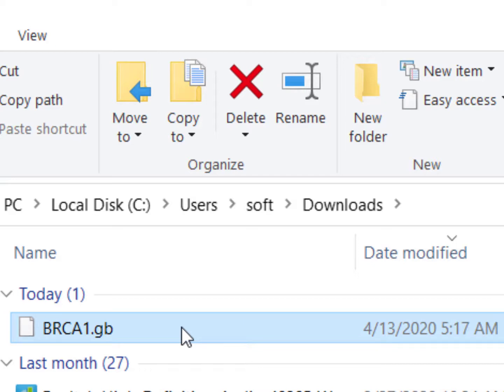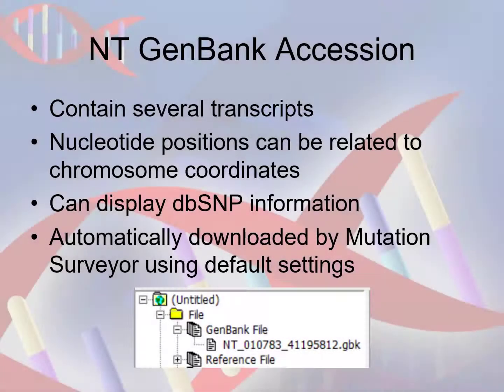The process is similar for NC accessions, with the difference being that NC accessions do not have the option to include dbSNP information. The third accession type we need to cover is the NT accession. NT accessions are the type stored in the database that Mutation Surveyor accesses when downloading GenBank files using the default project settings. They contain all of the available transcripts for the gene, and their nucleotide positions relate to chromosome coordinates. When downloaded by the software, these files contain dbSNP information.